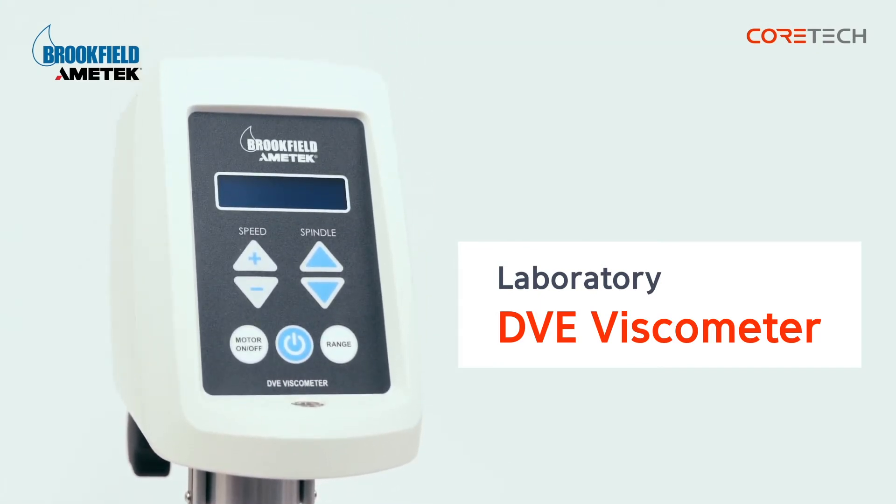There are 18 speed choices available for viscosity measurements. It also uses an LCD display to show information.